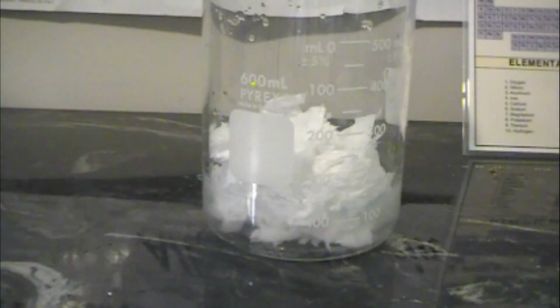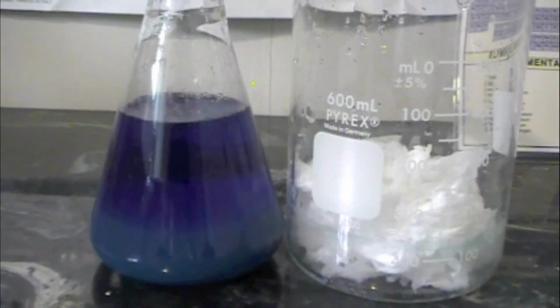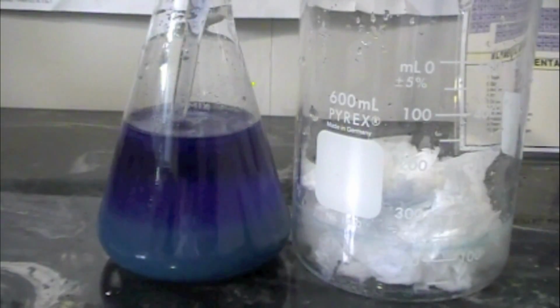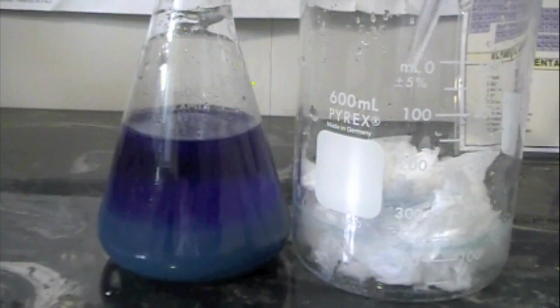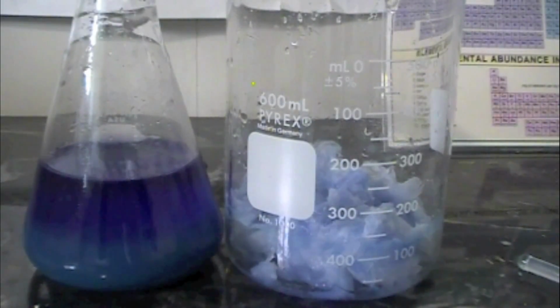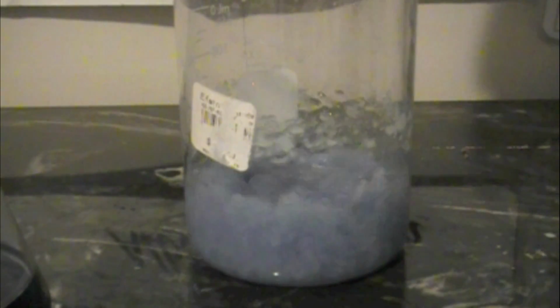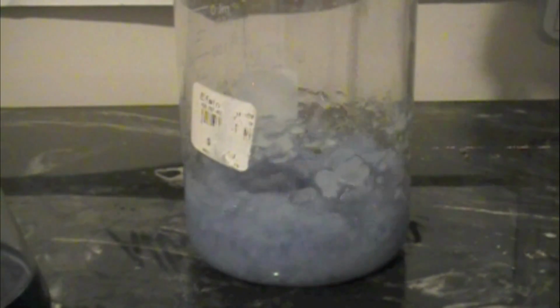So to begin, what we're going to need is some cellulose. In this case, I'm just using toilet paper. We're also going to need the Schweizer's reagent from the previous video. Now, the way to start is to draw some of the reagent up in a pipette and begin to moisten the toilet paper or other cellulose that you choose to use. Continue to use this until you have sort of a goop. Continue adding cellulose and then Schweizer's reagent until you have a very large amount. The more the better, but about 2 inches in a beaker is good.